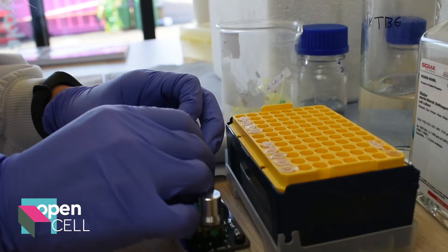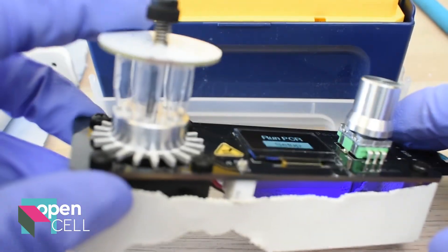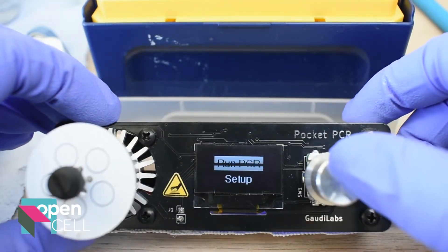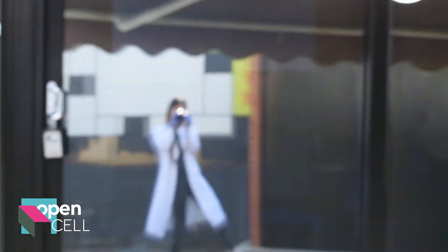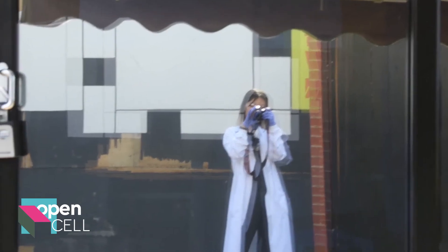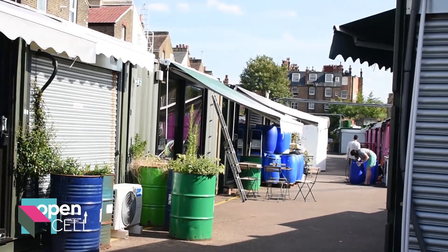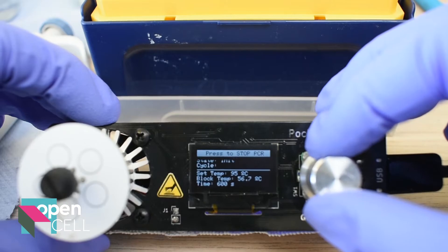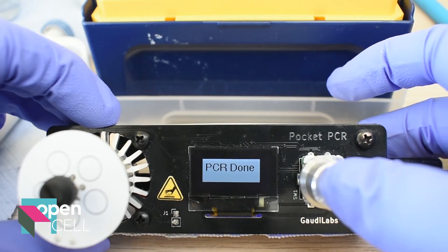Oh my gosh, you really need some super nimble fingers for this part. So over the next couple of weeks, I am actually going to take home the pocket PCR to run some experiments from the comfort of my kitchen table, to find out and prove that I am genetically a night owl. Stay tuned to see how I get on. Bye!